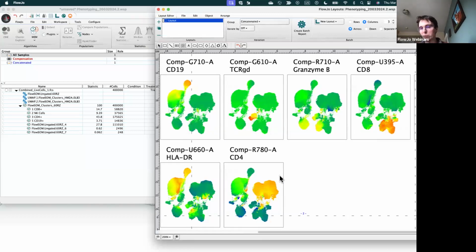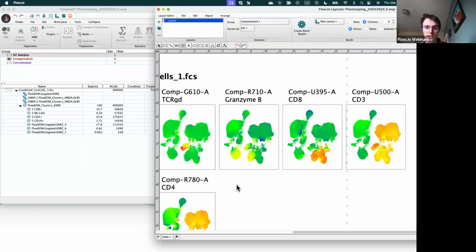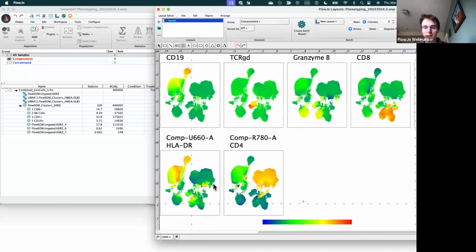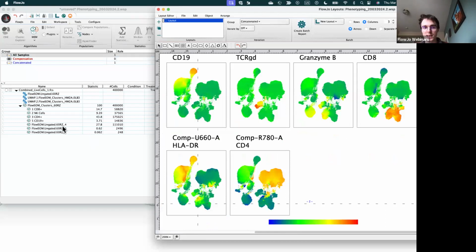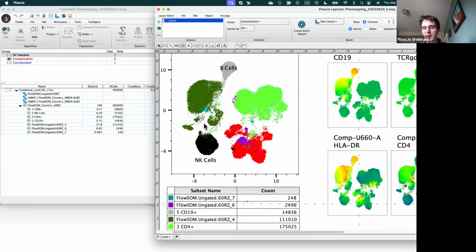So I'm betting that my monocytes are going to be missing here and are going to be negative for all the other markers. They're big cells, so they have a dim expression for all the other markers. I'm betting that on the left here, these are my monocytes. I might have a few cell phenotypes that I didn't really label with this panel that might be getting grouped in that big population over here. And in fact, I think that's what's happening with these other two islands that are being included with this one.